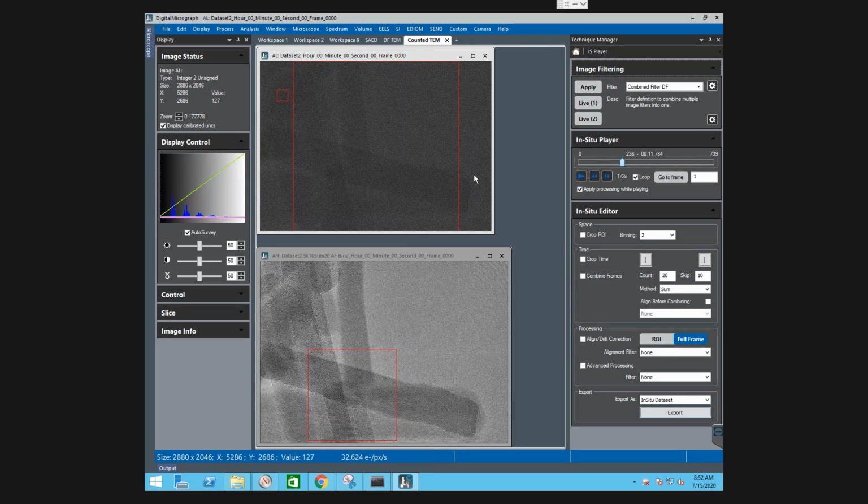Because we're using an integer data format and these are small integers, it's actually important to sum the data rather than averaging the data. We have several options here, including sum and average, but for counted data, we definitely want to sum.